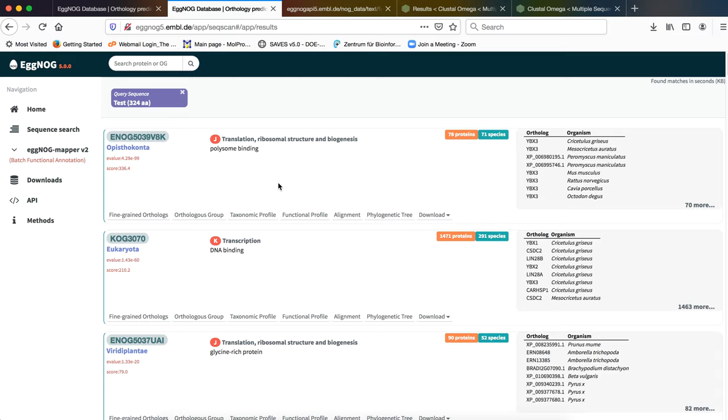Remember, we said that we are working with a eukaryotic protein. You can see the group that has been found to be most similar in context of orthology is Opisthokonta.